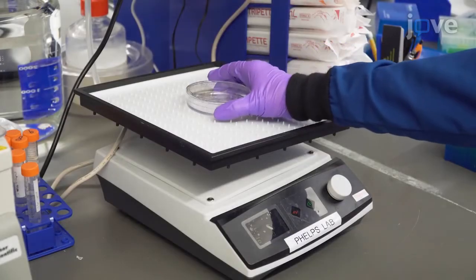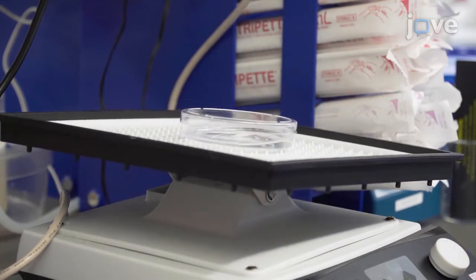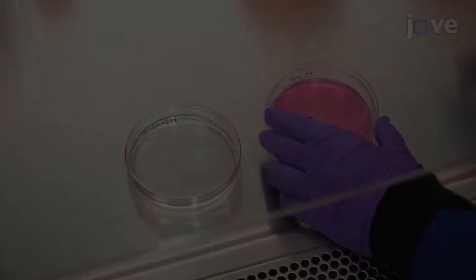Place the plates containing the slices on a rocker and incubate at room temperature for an hour at 25 RPM. If the slices need to be kept for longer, place the slices in 15 milliliters.